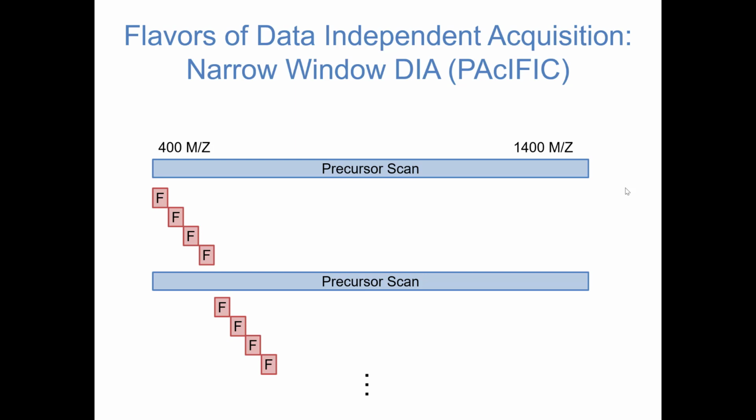And in those situations, you wouldn't necessarily be able to see a precursor. However, if you effectively tell the instrument to trigger on that time point or that mass range, then you can still collect fragment ions for that region because there is enough peptide there. It's just being masked by these very high abundant peptides that pollute the sample.